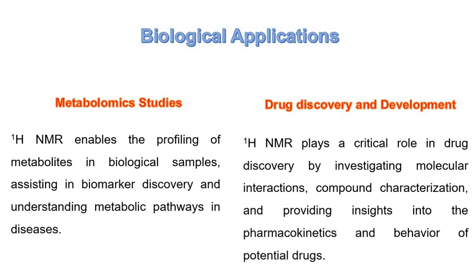Proton NMR in drug discovery and development. Proton NMR plays a critical role in drug discovery by investigating molecular interactions, compound characterization, and providing insights into the pharmacokinetics and behavior of potential drugs. It identifies lead compounds by analyzing their structure and purity.